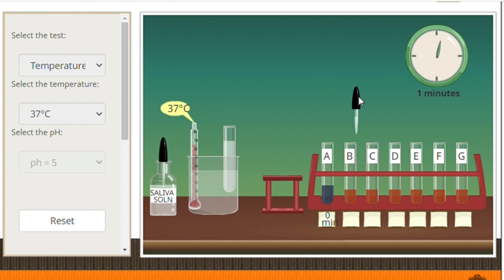Please take note of the color changes and always remember to record your observations right away, because you will be using this to answer your laboratory report sheet.